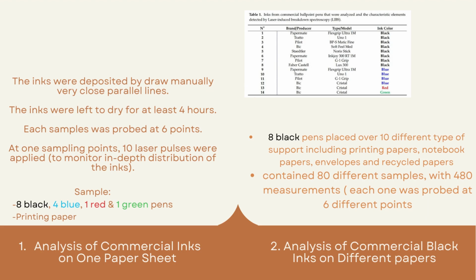At one sampling point, 10 laser pulses were applied, registering the spectra after each pulse in order to monitor the in-depth distribution of the inks.